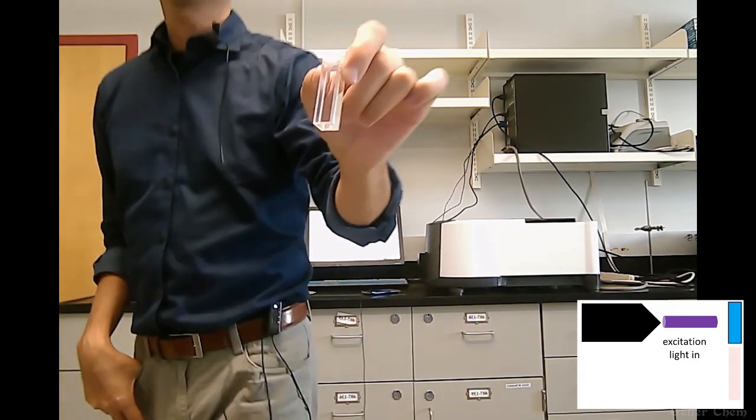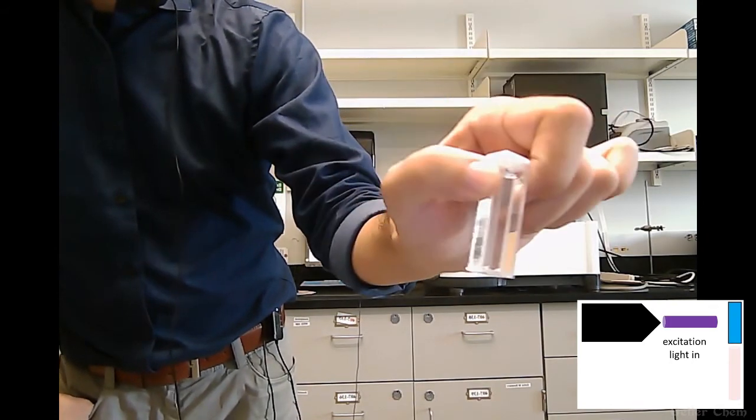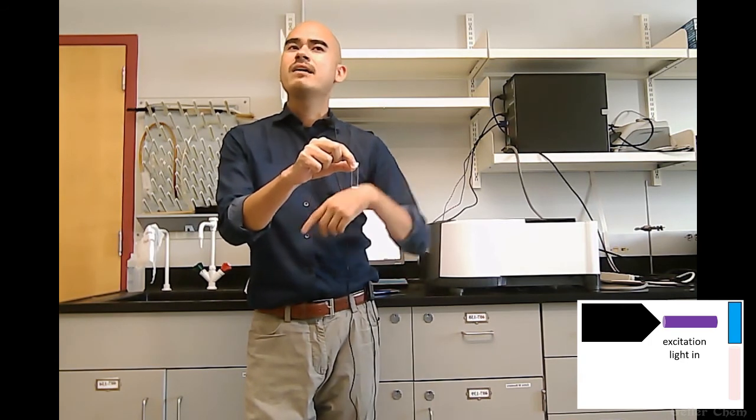So here is our fluorometer, and here is a fluorometer cuvette full of a fluorescent chemical solution. One thing to notice is that this type of cuvette is clear on all sides, and that's important because remember how this works. Light is going to be shined into one side, and in principle it comes out the other, but we're not really interested in measuring the light that makes it out the other side. That's what we would do in an absorption experiment. In this type of experiment, we're interested in the light that's subsequently emitted upon light being absorbed.